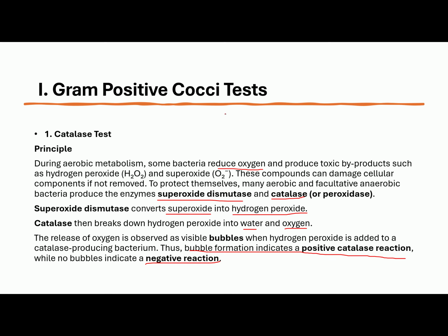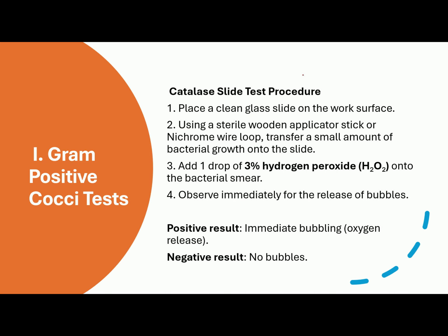To summarize, class, the reagent that you're going to use here is your hydrogen peroxide, and the positive result would be the presence of bubbles. So to explain further, here's the procedure.